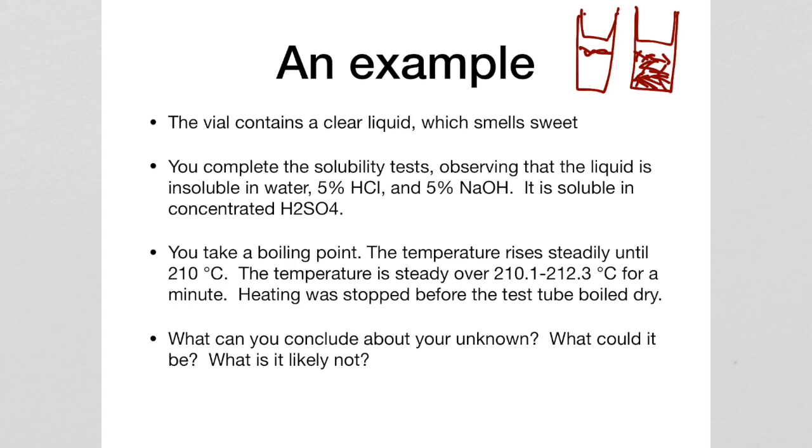So for this example, we're just going to do one compound, a liquid. It is a clear, colorless liquid and it smells sweet. The student is going to go through and do your solubility tests, and you note that the liquid is insoluble in water. When you add a few drops of this to the test tube, it floats on the water. It does the same in 5% hydrochloric acid and 5% sodium hydroxide. It is, however, soluble in concentrated sulfuric acid.